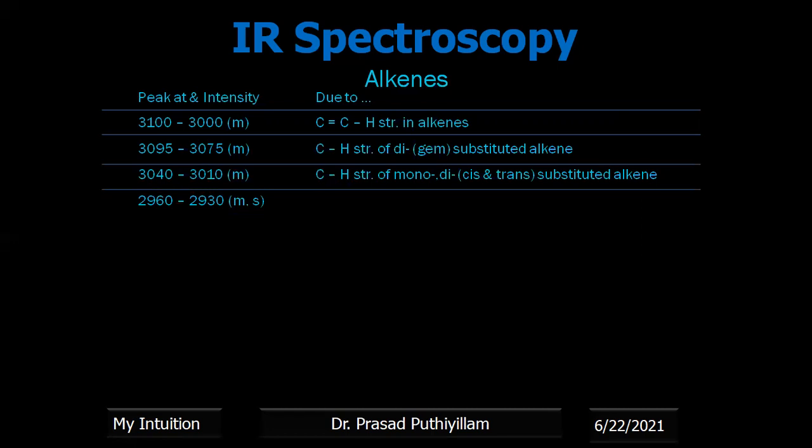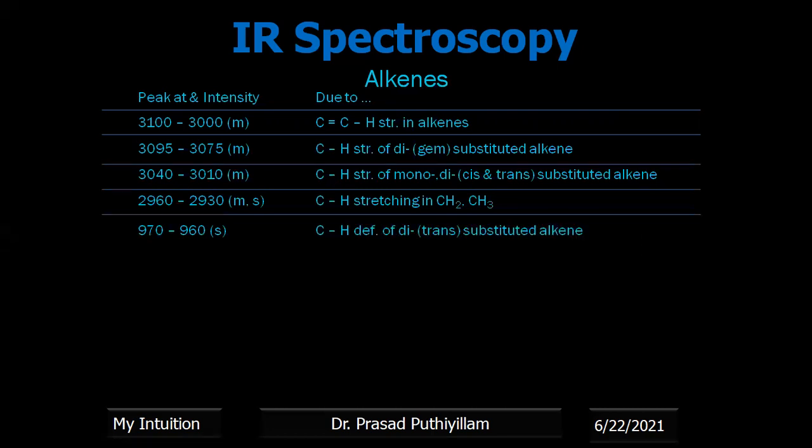Then around 2960 to 2930, medium to strong bands are expected with the CH stretching in CH2 as well as CH3. Then 970 to 960, CH deformation of di-trans substituted alkenes.